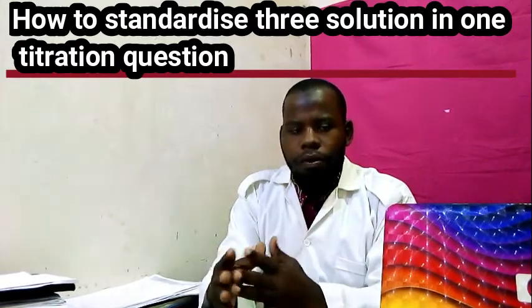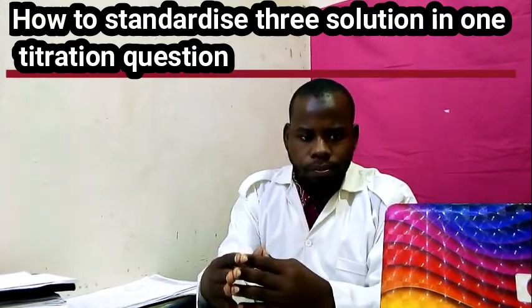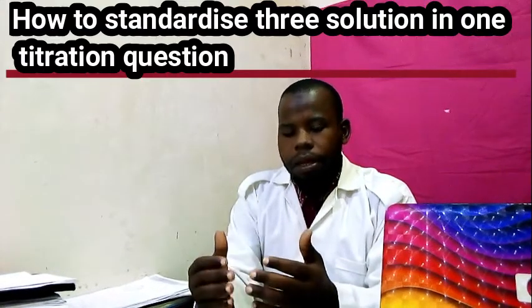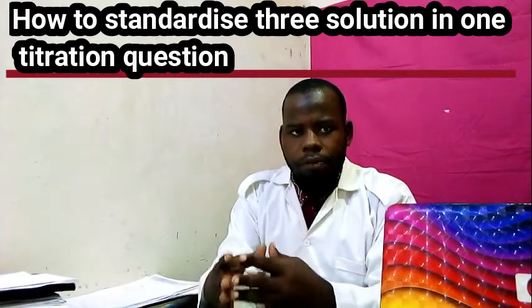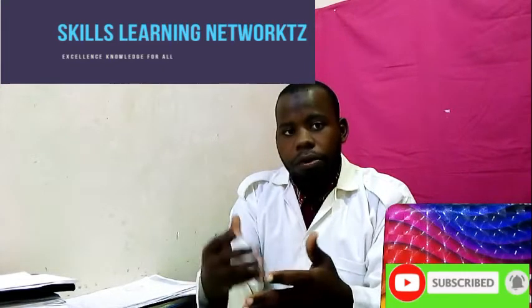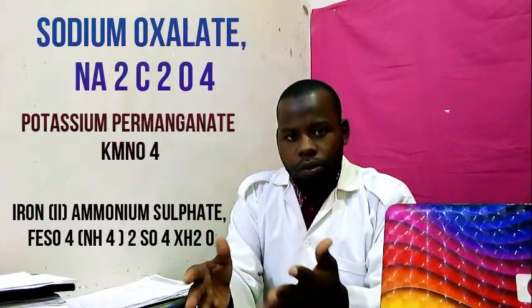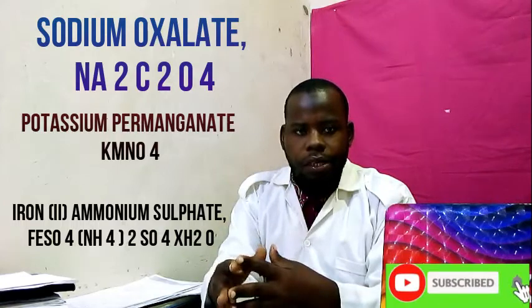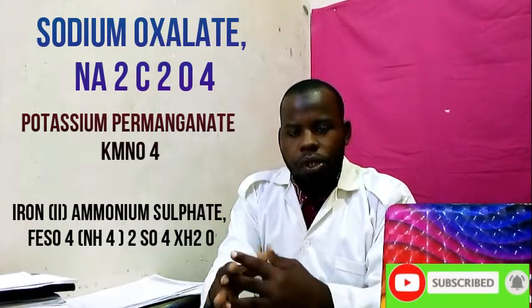which you are going to perform in one question. For example, in the NECTA Form 6 Chemistry 3A examination, there was a question with 3 solutions: C1, C2, and C3. There is potassium permanganate and sodium oxalate. There is potassium permanganate and ammonium ferrous sulfate. This was question number 1.